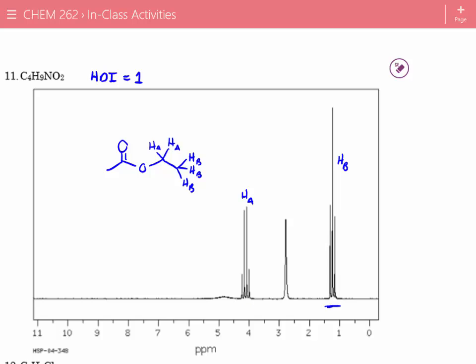And then we've got these remaining 2 peaks over here and over here with this hump. If we look at our molecular formula, we're missing a nitrogen and we're missing a methyl group. So one functional group we haven't seen is this one. This functional group is called a carbamate. It's very commonly found in plastics like urethanes. It's a common functional group that we haven't really discussed yet.